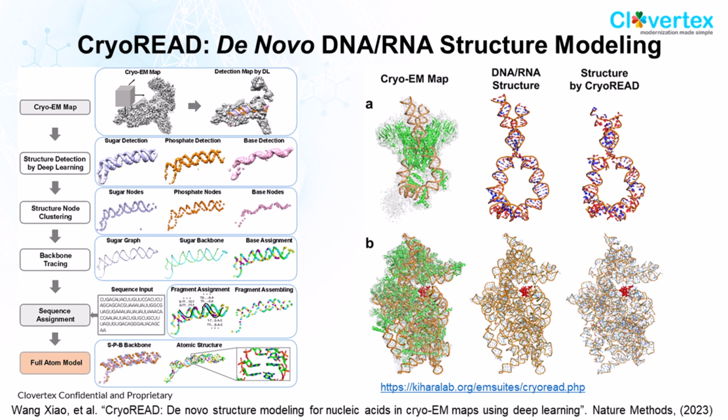A very important thing for this pipeline is that it is fully automated. Actually, there are parameters in it, but CryoREAD will basically use all the combinations of parameters inside, and then at the end choose the best model by checking the score.